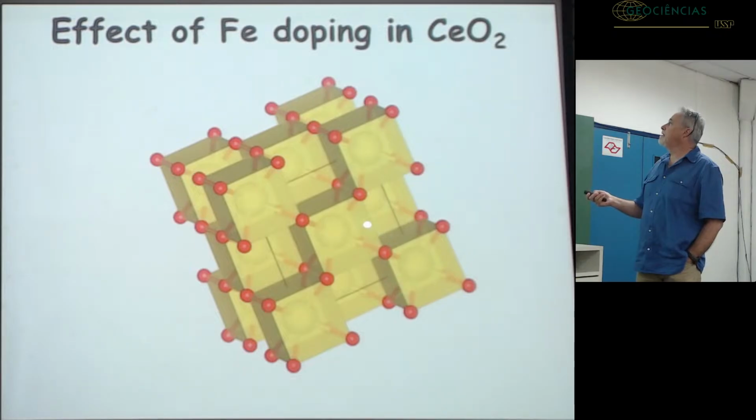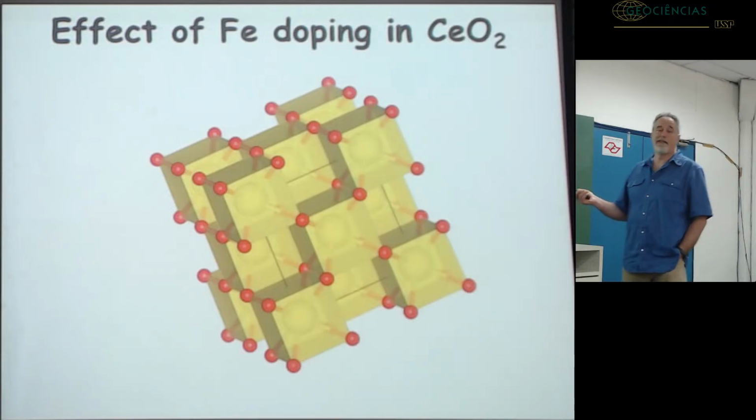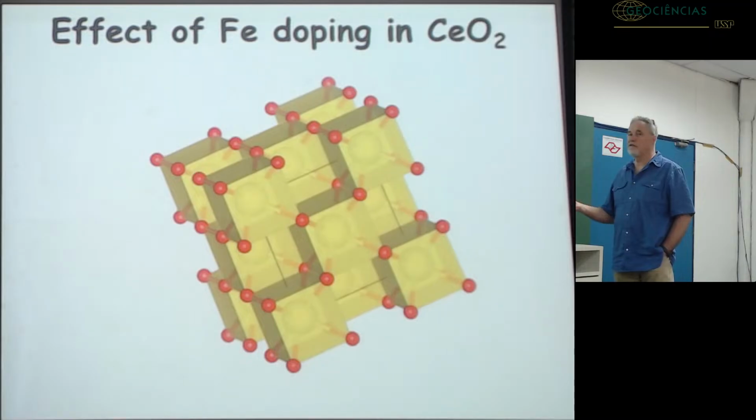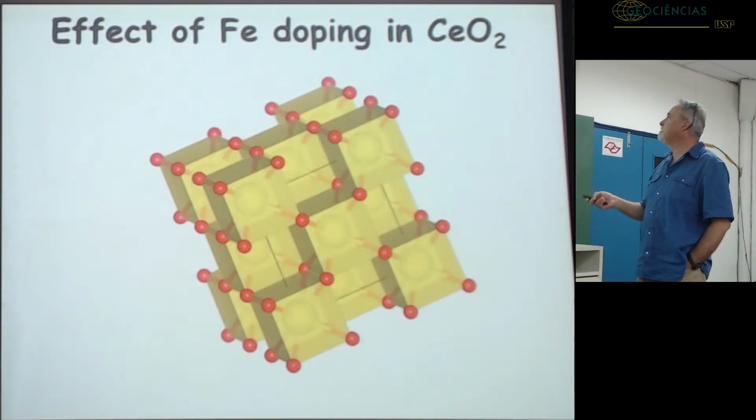in those empty cubes, because that's the only space left. And when each lithium enters, one of the cerium atoms must reduce from 4 plus to 3 plus. In this case, the structure is in the anode. That's why we have the reverse. Lithium enters and it reduces.